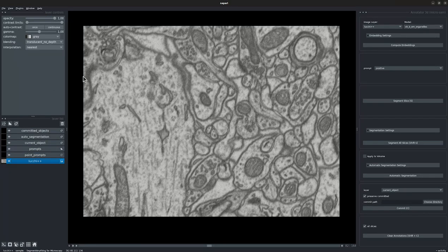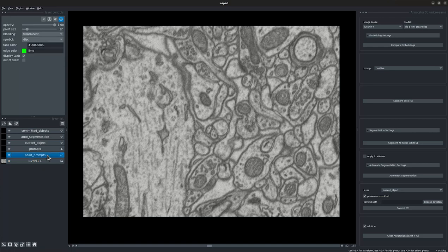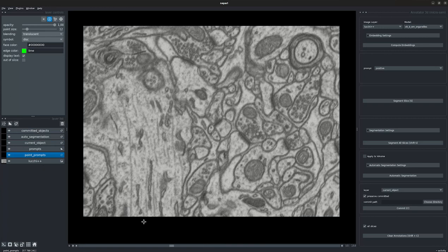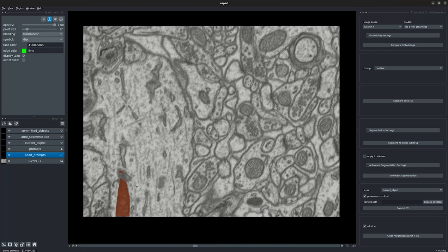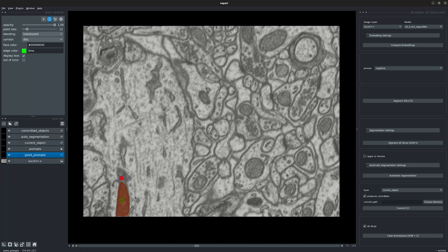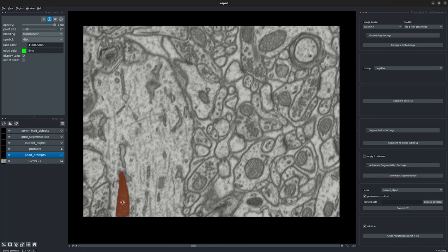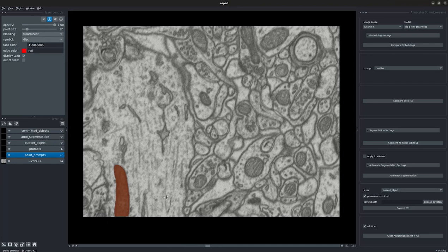In this additional section we will be showing how you can interactively correct the projected segmentations along consecutive slices. We choose point prompts for making the segmentations and select an object. Let's put a positive prompt, segment it, and then segment across all the frames. We see that the segmentation was possible in all the frames, but there are some issues with some of them. Let's fix these segmentations by putting a positive prompt on the object and a negative prompt outside the object. Let's do it for another frame as well. This is how you can rectify the segmentations for consecutive slices. Now we go ahead and commit our segmented object.